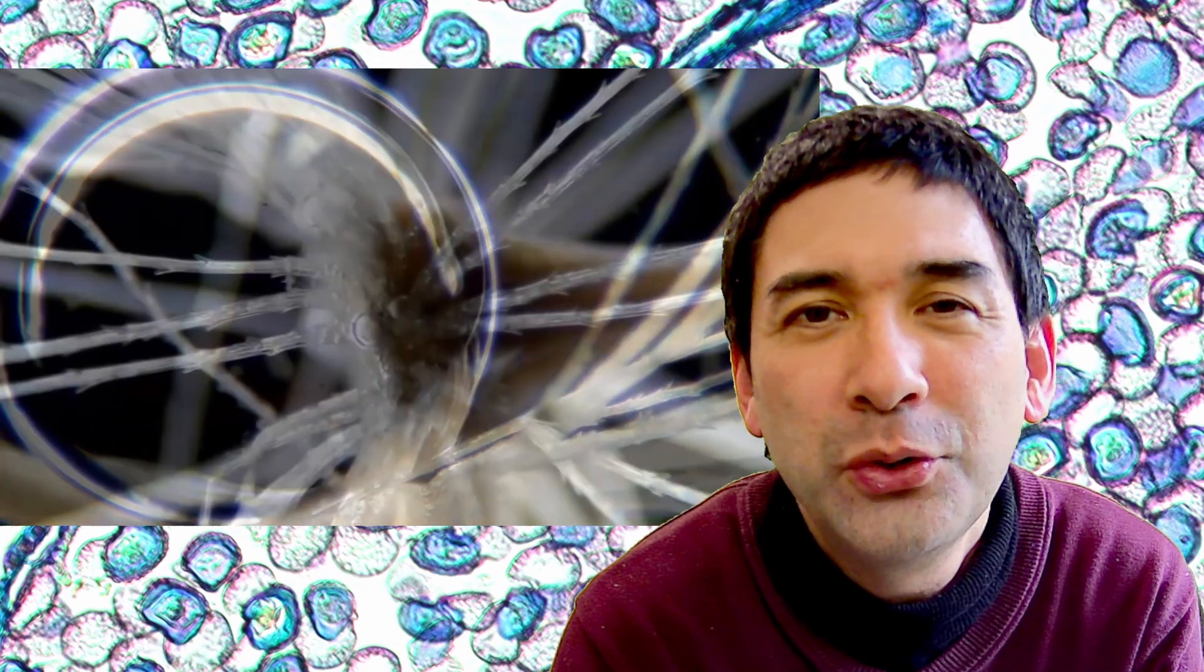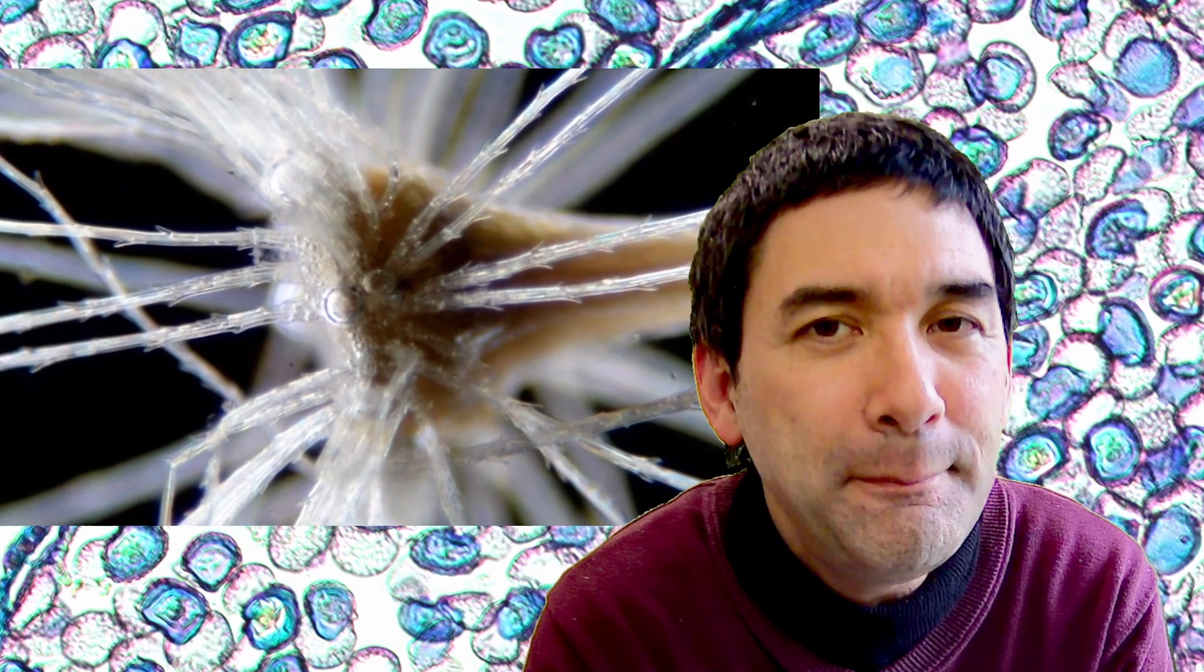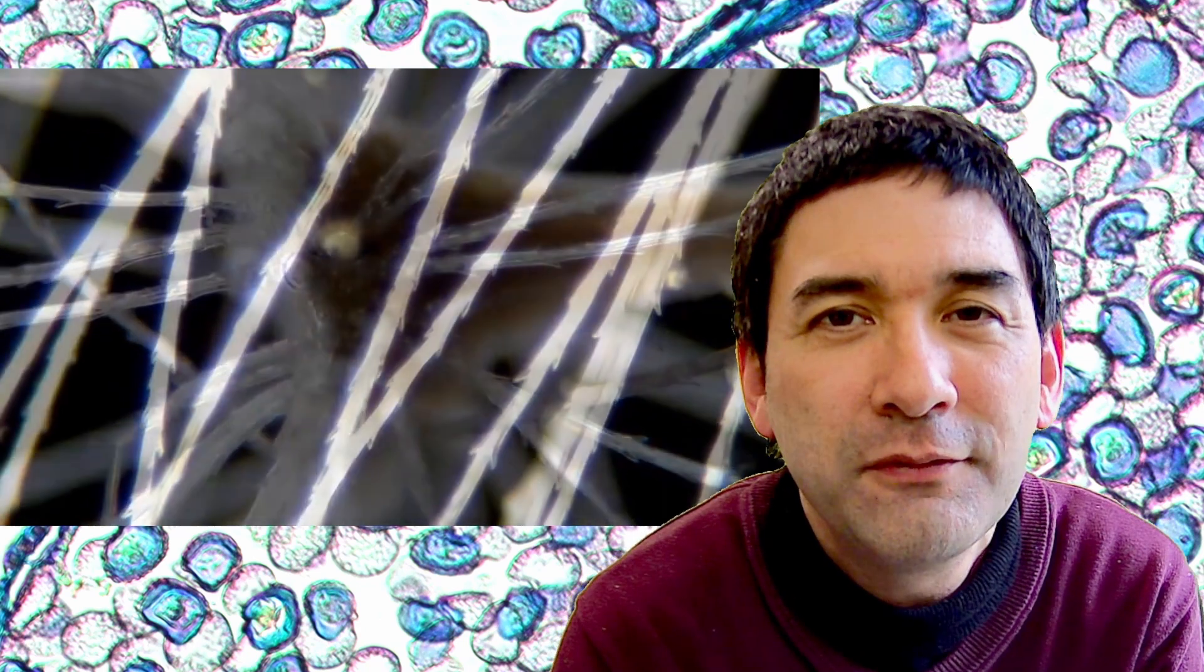This seems to be epi-illumination with light coming from the top. I probably used my four times magnifying objective with light from the top. This is pretty bad. Look at this—it's way overexposed. The background is dark, which is fine, but the structure of interest is almost completely white. This shows that the camera used automatic exposure settings.